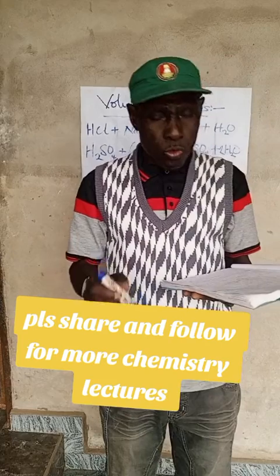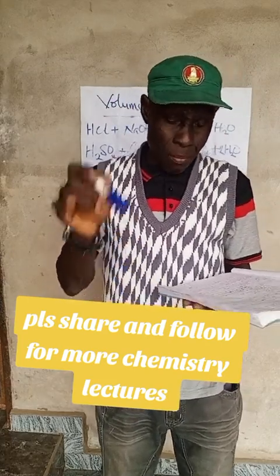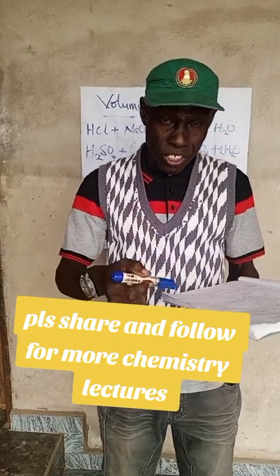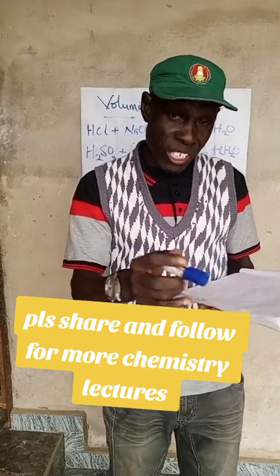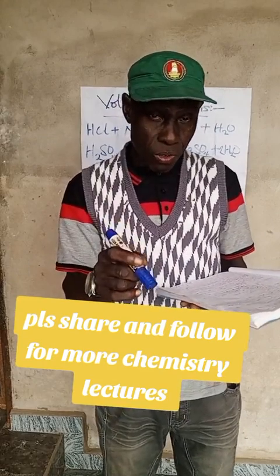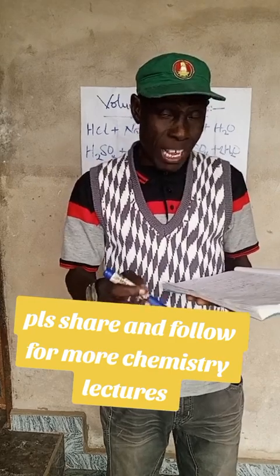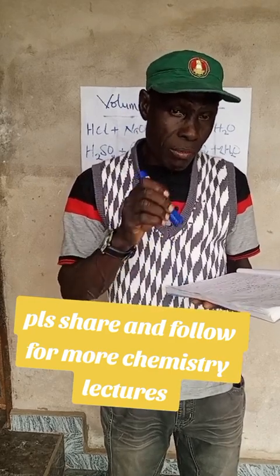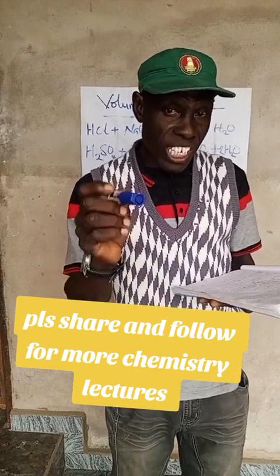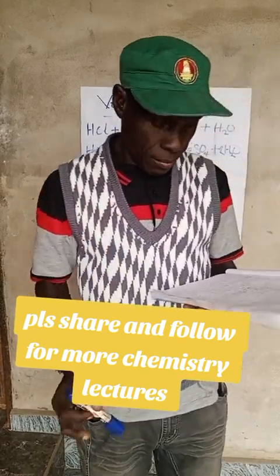So when you put 2 or 3 drops of methyl orange in the base, the colorlessness of the base will turn to a yellowish color. The 20 cm cube or 25 cm cube of the base you have pipetted is colorless. By the time you drop 2 or 3 of the methyl orange indicator, the color changes to yellowish. So these are the areas you want to be very observant.